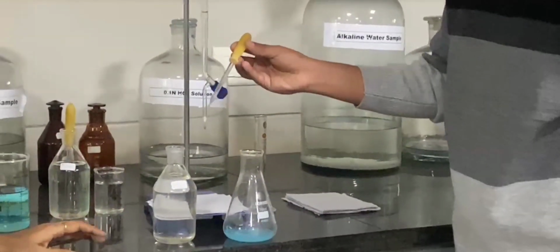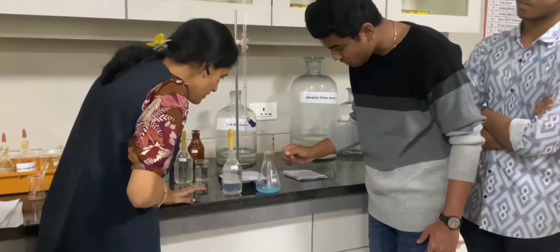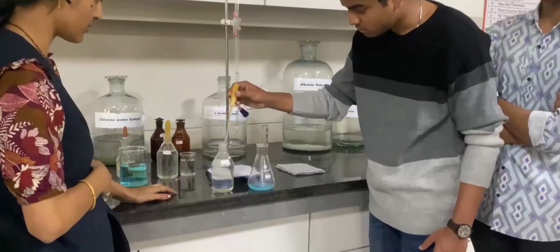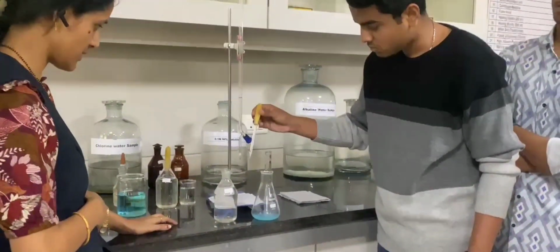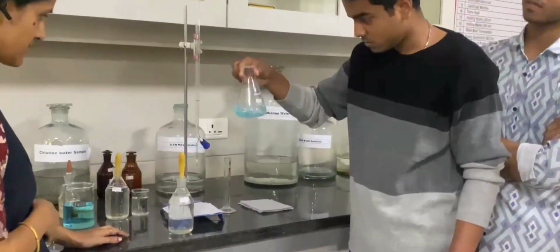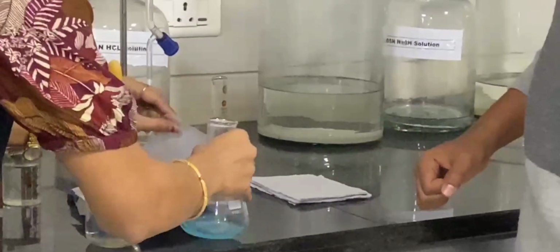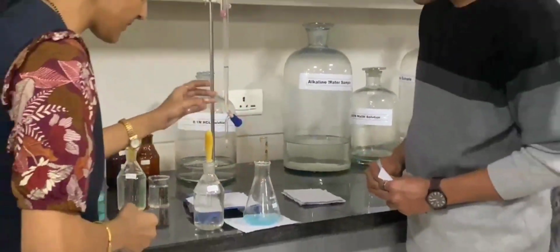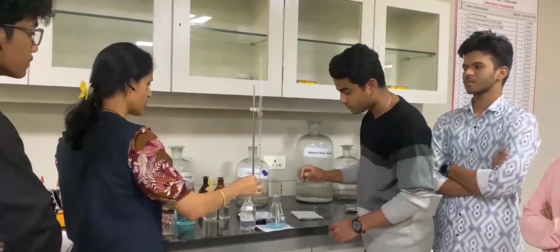Okay, it's enough. Now you can see the turbidity is removed. Add two to three more drops. Shake. Now the turbidity is removed. Now you have to add the potassium iodide to the solution.